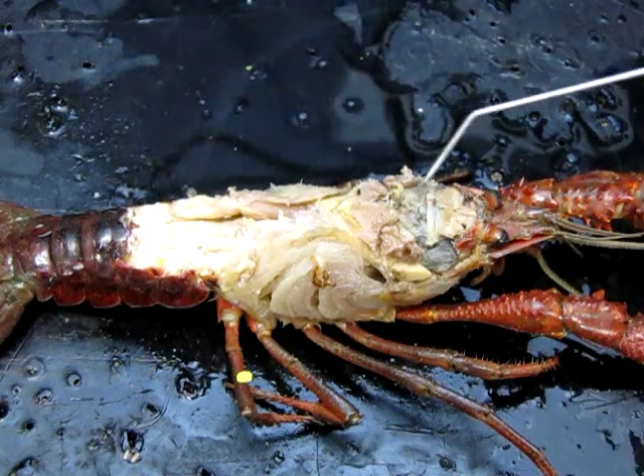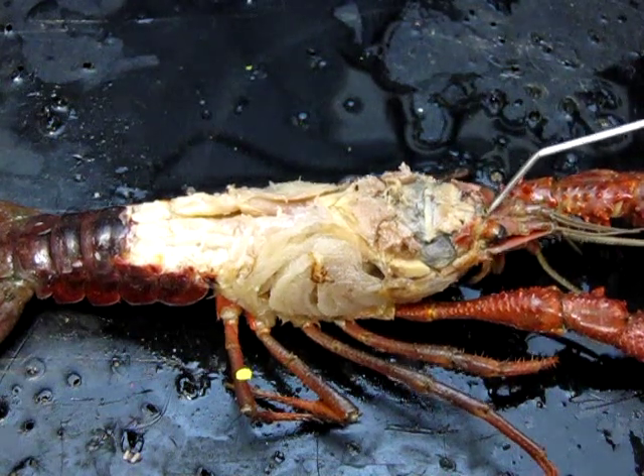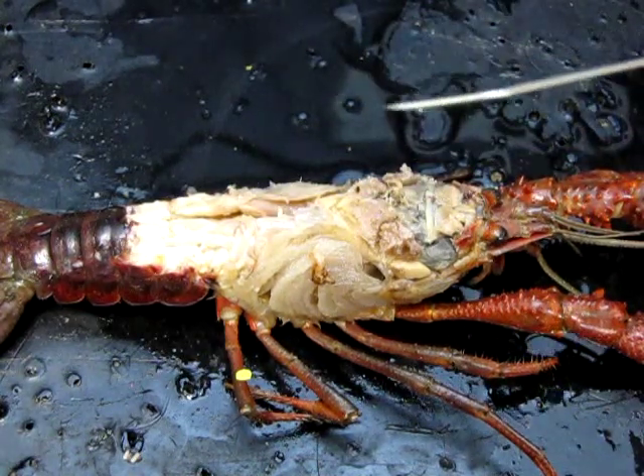I have removed basically the dorsal surface of the cuticle here, from the tip of the rostrum — which is the little pointy bit — about halfway down the abdomen. It's enough that we can see what we need to see.